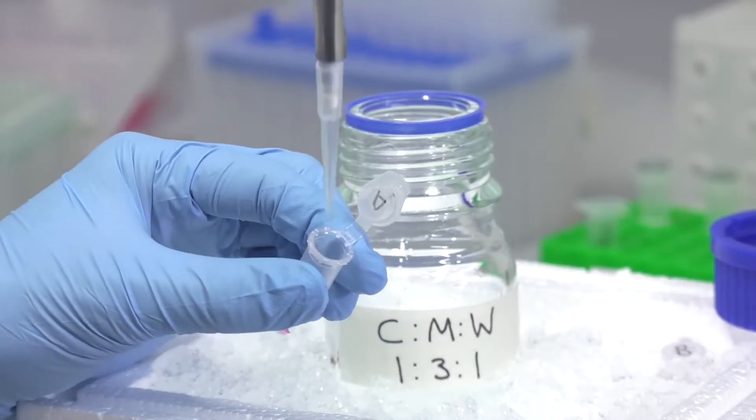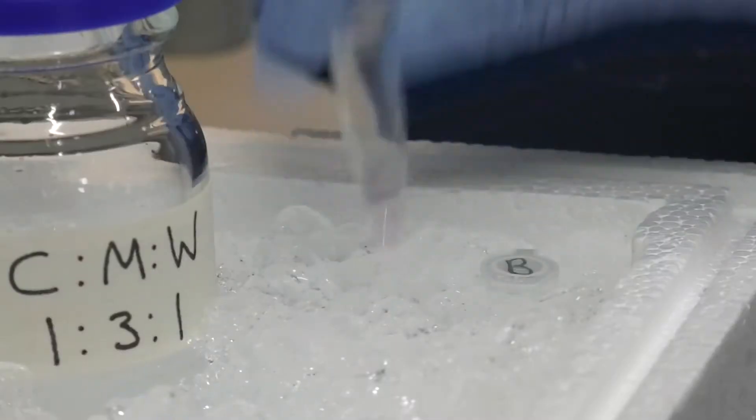Step 4. Centrifuge again to remove all supernatant. Resuspend in 200 microlitres of your extraction solvent and vortex briefly.